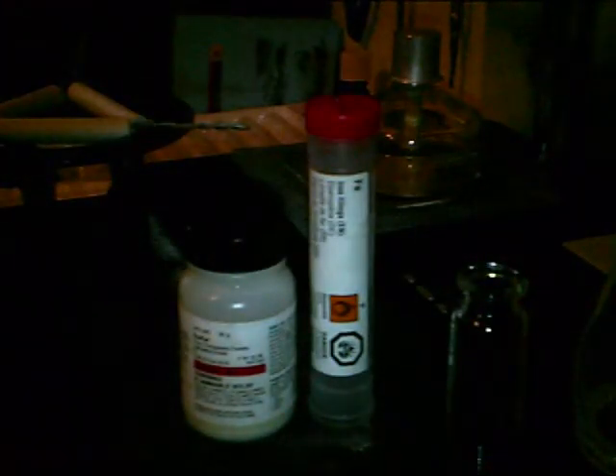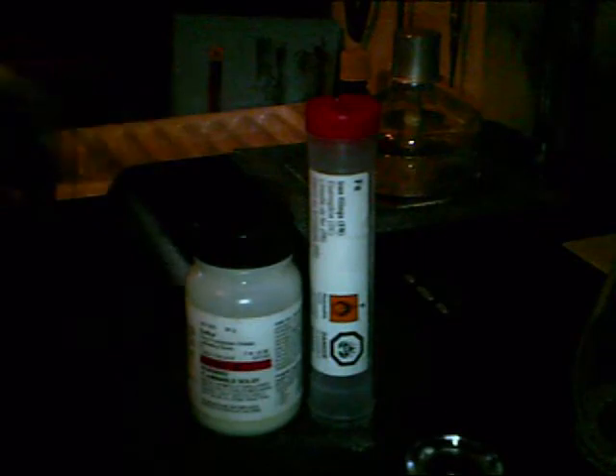What you need for this experiment, other than the sulfur and iron filings, is a vial and a top to hold your finished product, a metal basin or just a metal plate or jar. And if you want to use an alcohol burner, I'm just going to use my lighter and burn it. I'm going to take this and a clay triangle if it doesn't fit, and you can just place it on top of there and use that.